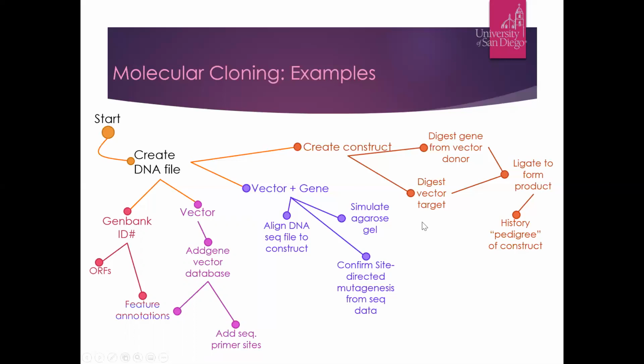Can they do it just by cut and paste restriction enzyme cloning? So they can practice that in the SnapGene software. Are there compatible restriction enzyme sites that will allow me to make that transfer? And then they can do it in silico, and it will say, oh, well, your gene's going to be backwards. Or, oops, you cut out your GFP by using those sites. So yes, you can put your gene in, but you're going to get rid of your GFP tag.